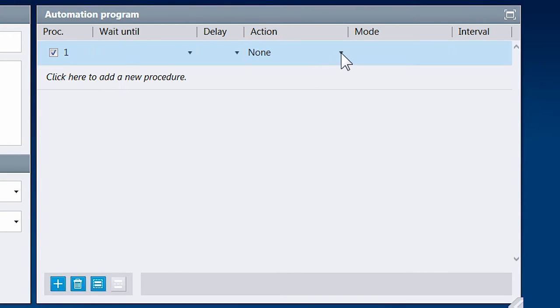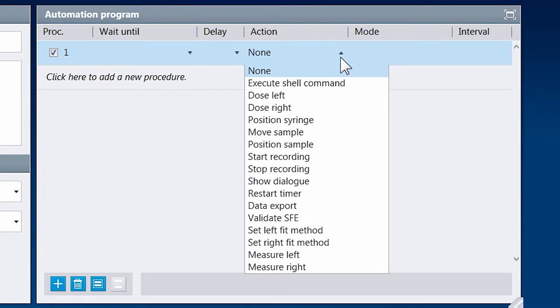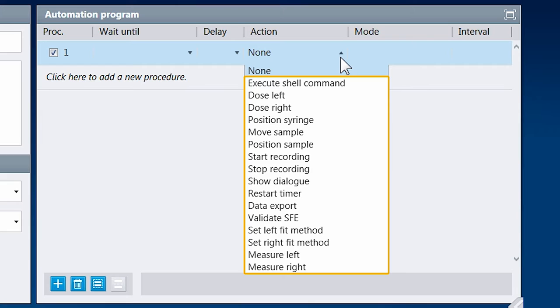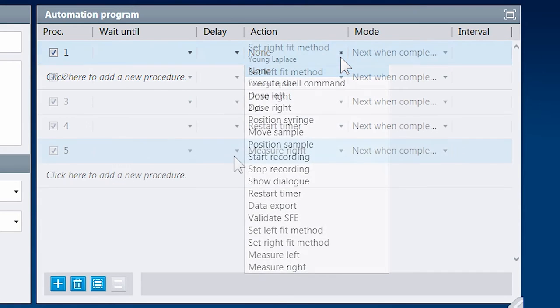Our already comprehensive list of possible actions is always growing, and they range from moving the sample to exporting the data after a measurement has been completed. Let's skip ahead a little bit. You can also delay the start of the action.